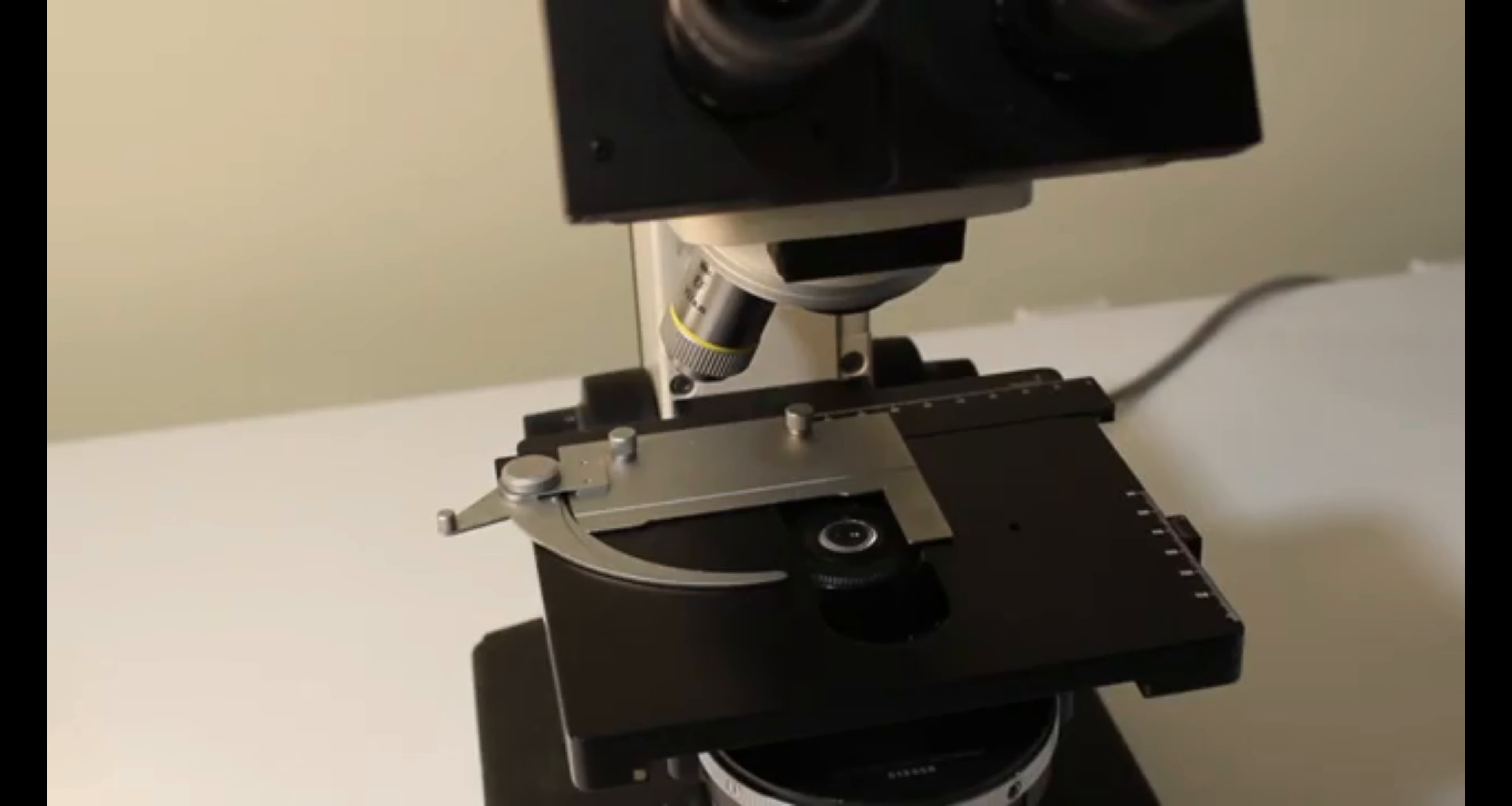In this episode we're going to talk about how to focus on your sample and switch between magnifications. For this video I'm going to assume that you've already aligned your condenser properly. This is a topic I'm going to cover later in the series in episode 5.